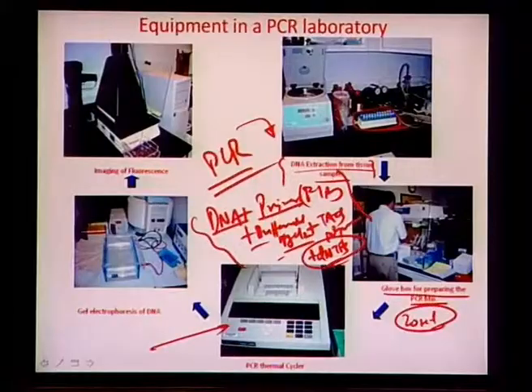This is how a thermal cycler works and looks. This is a system from Applied Biosystems, almost the size of a desktop computer. You have an LCD screen where you can do the programming, these are the interaction modes with the machine, and there is a PID controller inside. This is a 96-well aluminum block which is thermally cycled rapidly, so it is a high throughput process. You can load 96 tubes into this block and do the thermal cycling all at once.